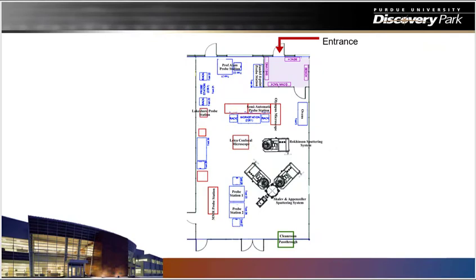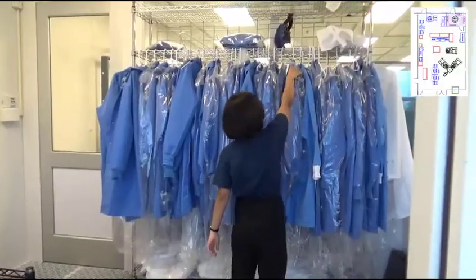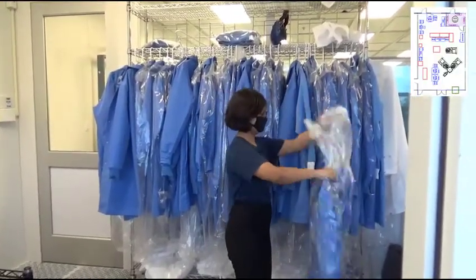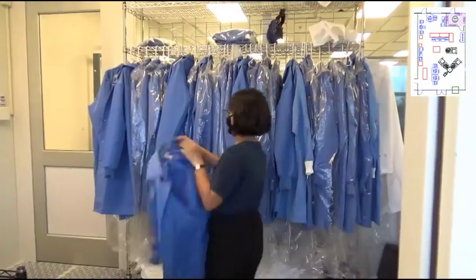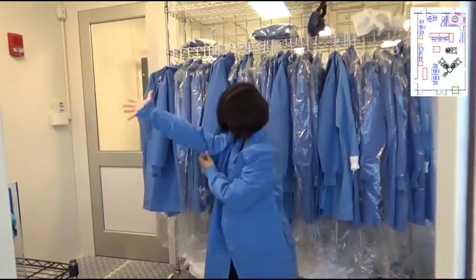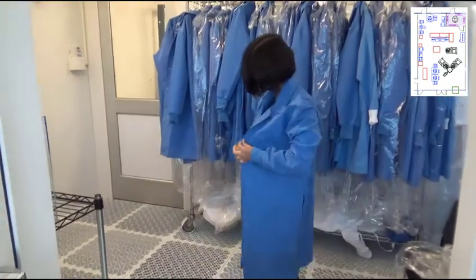2H02. You must swipe to enter J-Bay, and once you enter you are located in the gowning area, highlighted here in purple. To properly gown, locate your lab coat on the rack. If there is no room on the rack, you can store your lab coat at your desk or in your locker. If you need a lab coat, you can order one from the stockroom. Then get shoe covers from the bins.